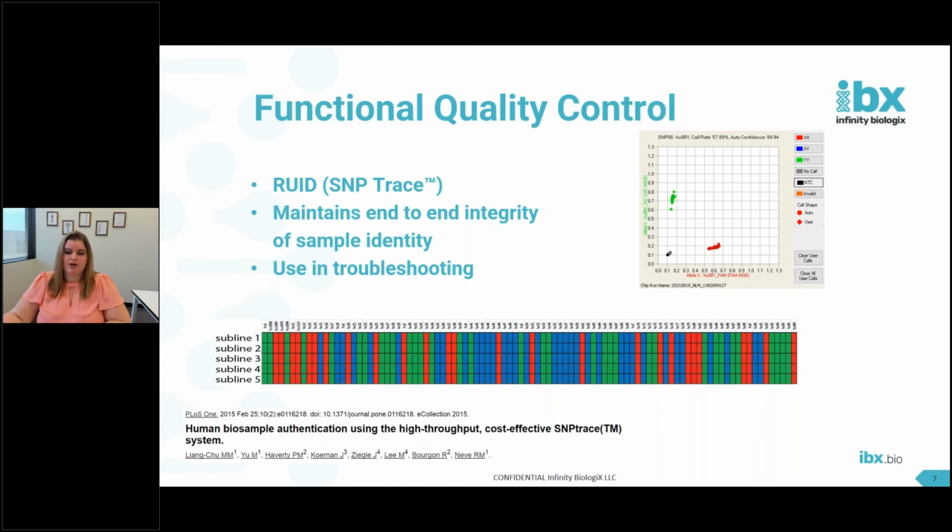This information can also be used to assure a client that the data that has been released is accurate should questions arise downstream of release. Any quality check we can put in place to catch or prevent human error is paramount in releasing accurate data.